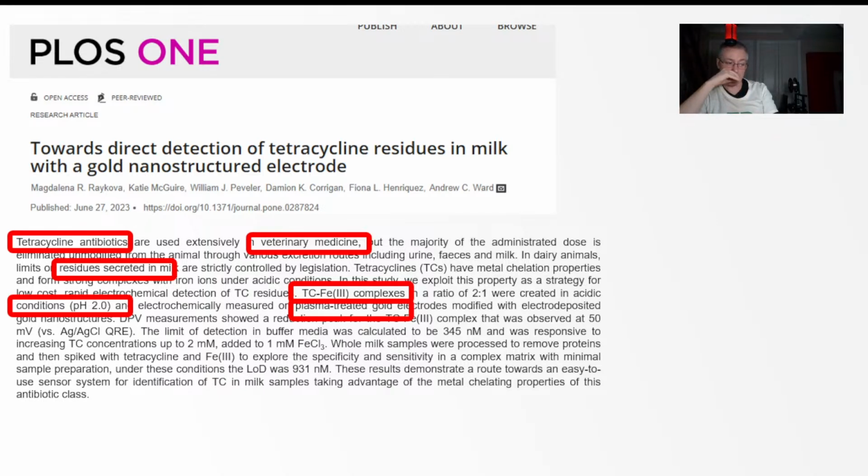This is a personal opinion, I really quite like carbon electrodes. Now, why do I say that? I understand the sensitivity of theirs, and there'll be an IP position here as well. But electrodes like this are really cheap, low cost to produce. We've got them in a very elegant form factor, the way it will actually clip into the potentiostat. We can also do them in gold as well.